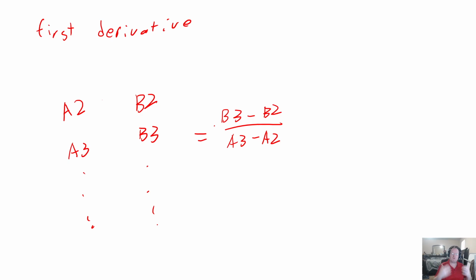This will also help even more when you're looking at a diprotic or a triprotic acid, because in those cases, your last equivalence point is usually really clear. But the other equivalence points aren't always. Sometimes when you switch from one equilibrium to the next, there's enough difference in the pKa that you can identify where it happens, but it might not be as clear, especially in real data, not in the data you had in your textbook. And sometimes because of the particular acid, it might just be a really slow slope or a really small change when it's that abrupt. So this calculation will help give you evidence of that.